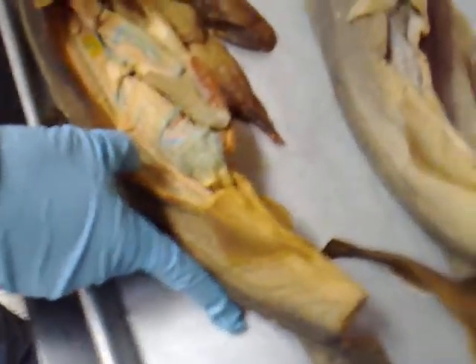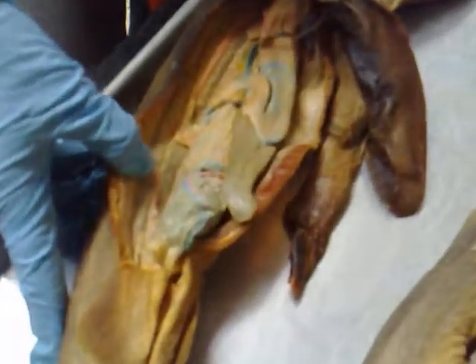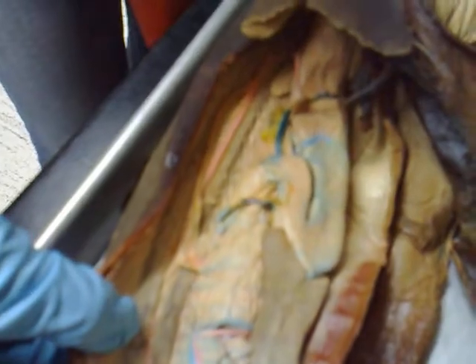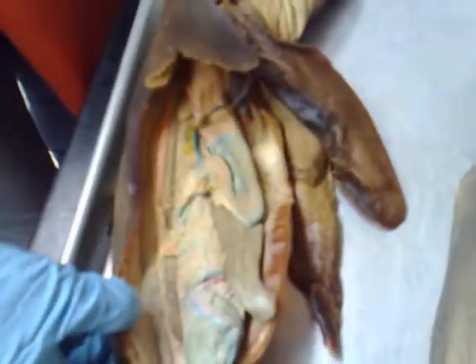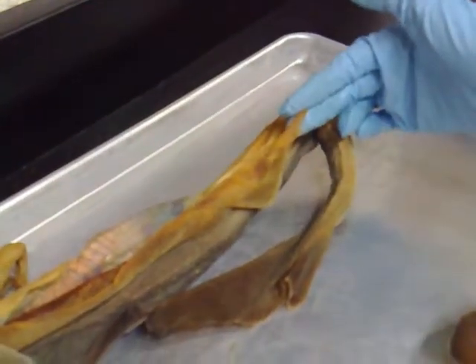There's one right here — one of these females is better than the other for viewing the uterus. Let's take a look at this one. So first thing with dogfish, you gotta find the claspers. If you're dealing with a male or female and you don't know which, the claspers will tell you.